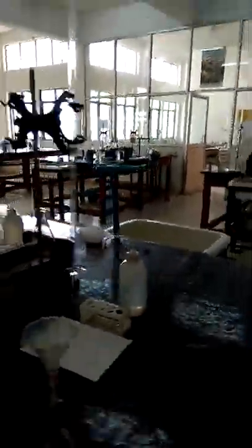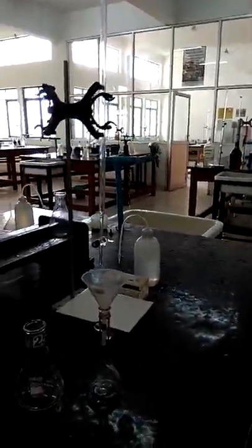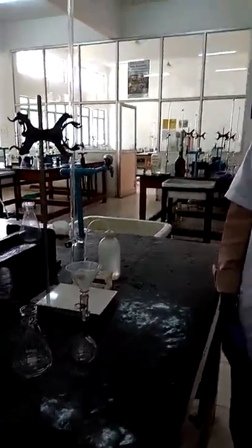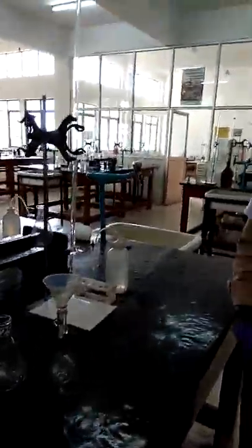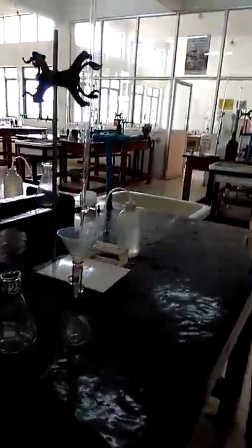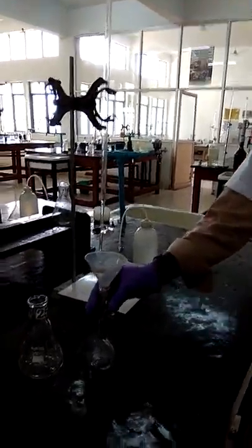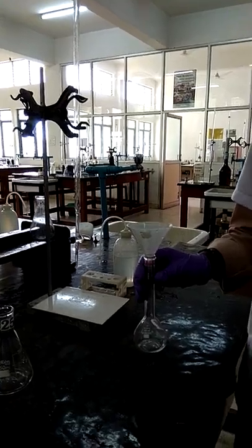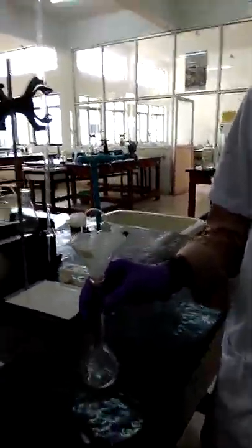Since it is already washed and kept, we are using it directly. But when you are performing the experiment, wash all the required glassware three times with tap water, and one time with distilled water. First, we are going to start with the preparation. We take the standard volumetric flask and clean conical flask, and come with the data sheet. Okay, to take the salt.